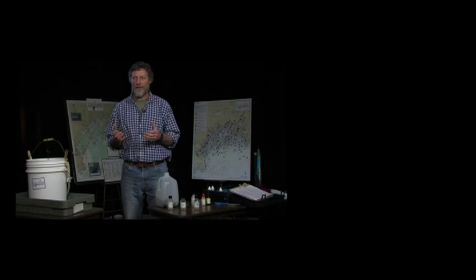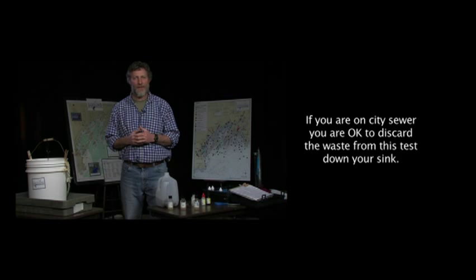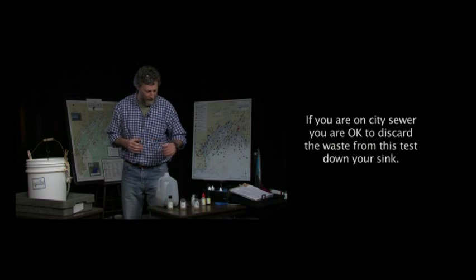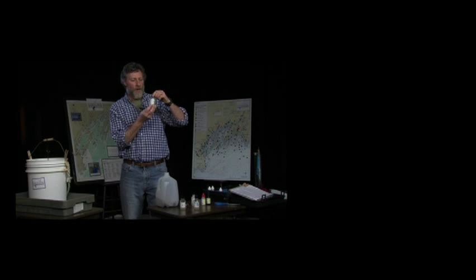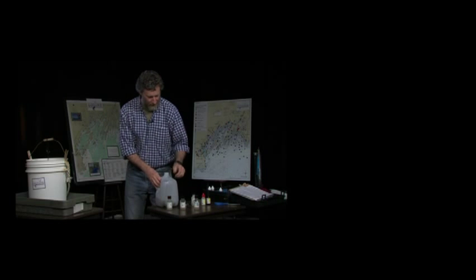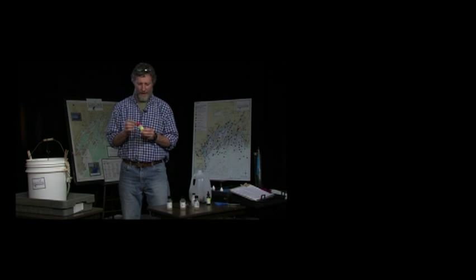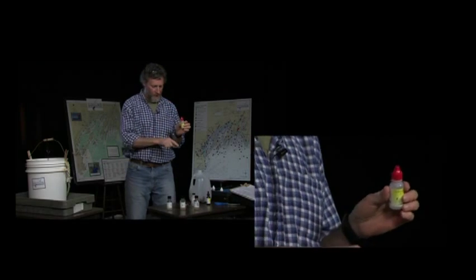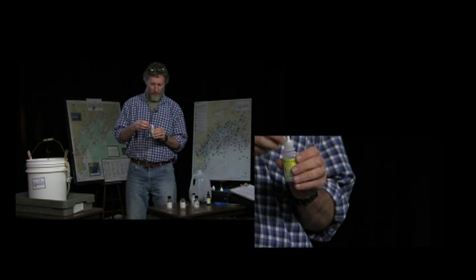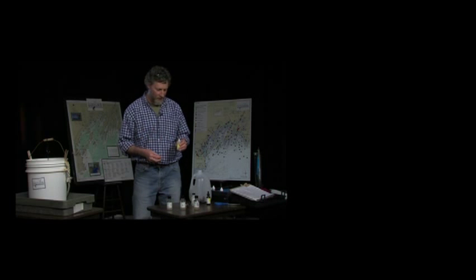If you're on a municipal wastewater system or town sewer, then small portions of these chemicals aren't harmful to put down the system, and you can use your regular kitchen sink. But what we're going to do is we're going to add another chemical to all three of these bottles, which is a sulfuric acid. And in your kit, it's labeled bottle number 3, and it has a red cap on it. We're going to add 8 drops of this to all 3 bottles, and it will change the color of this fluffy precipitate into more of a yellowish color to it.